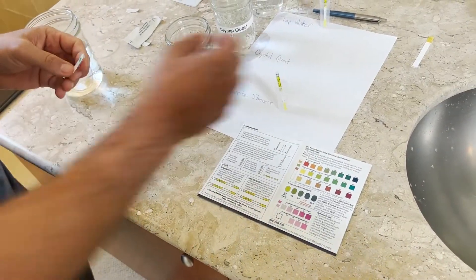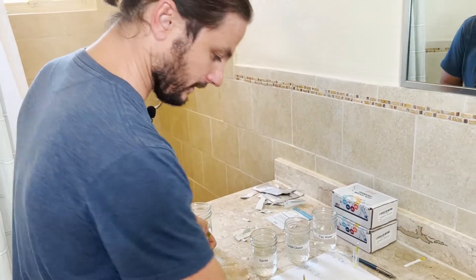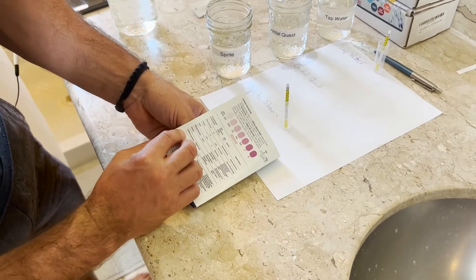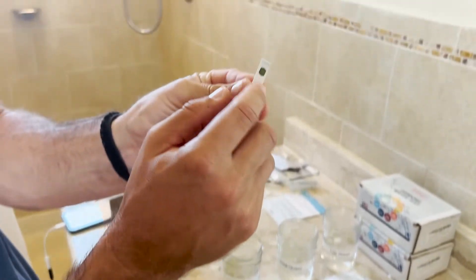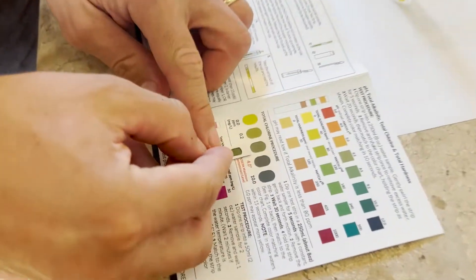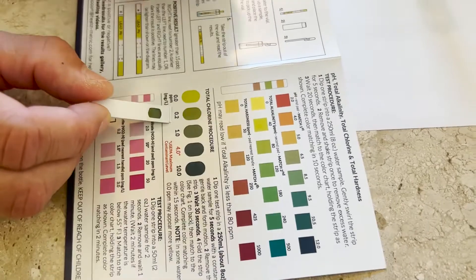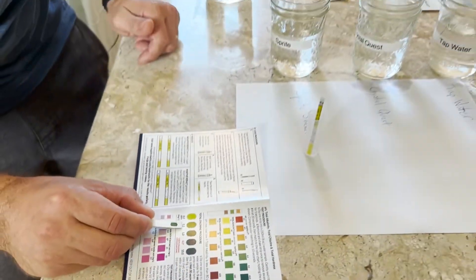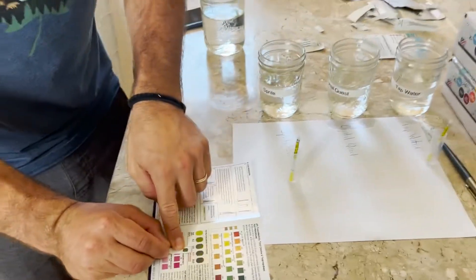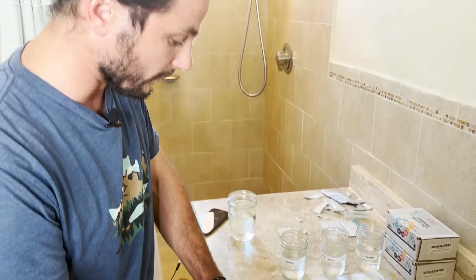Actually, I think maybe the backside is what we're supposed to be looking at. I'm doing this open-box style, learning with you here. I read the instructions once — they said fold it in half. So we fold it this way to get a clean look at the color. About 30 seconds have passed and this thing definitely detects chlorine. It wasn't that the previous tests were void in any way — it just means our tap water doesn't have any chlorine. Definitely a 1.0 parts per million on the chlorine scale for the pool water. So there you go, HealthMetric works.